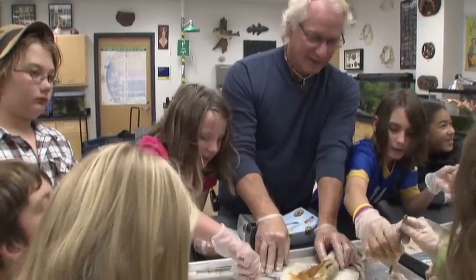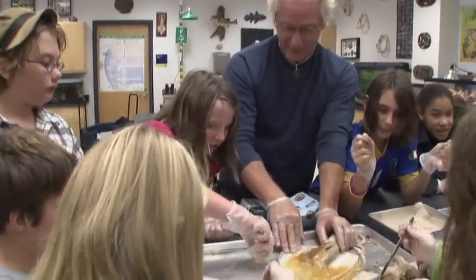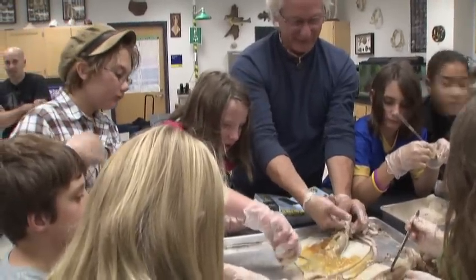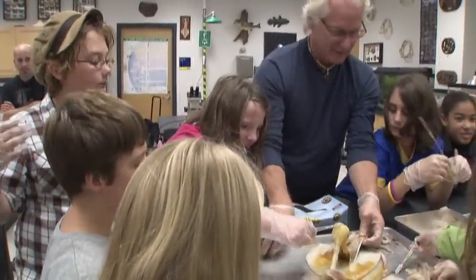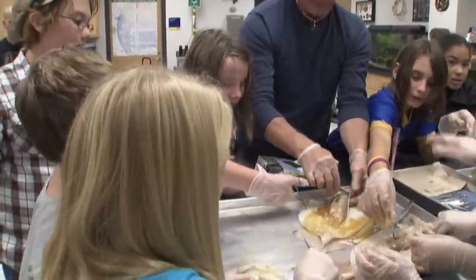Oh, this is like fleshy. Yeah, this is all muscular. It's very muscular because remember it's sucking in the water and pushing it out this funnel right here. I didn't tell you guys this. You see these muscles right here? These are retractor muscles. They pull on the funnel.